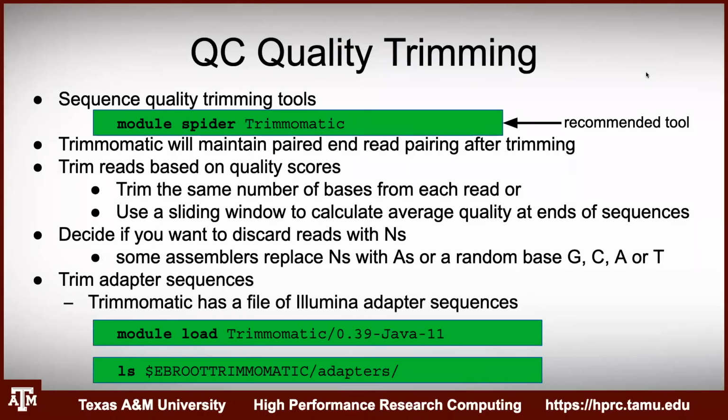Is it necessary to trim off the adapter before going through mapping? Because if I go through the raw data, it will have the adapter. It depends on how the program handles it, but it can actually interfere with the alignment.